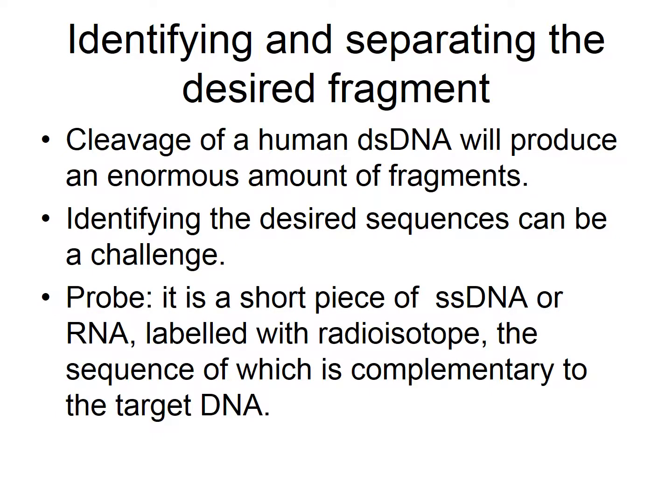And this is where you get probes. Now, what are probes? Probes are a short piece of single-stranded DNA which is radiolabeled. This single-stranded DNA is a DNA whose sequence you already have an idea of, and this sequence is complementary to the desired DNA of interest to you. So you use this DNA probe, the single-stranded DNA or an RNA probe, and allow it to combine with the specific sequence of the code which you want to extract. In that sense, that particular fragment containing your gene of interest is identified using a probe.